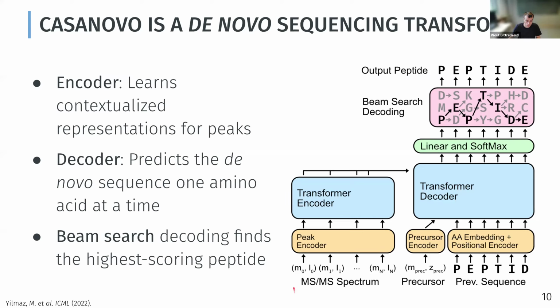Yeah. So the encoder receives just the peaks of the spectrum as input. And so each peak is represented by a tuple of two values, the mass and the intensity. And those are both encoded using a sinusoidal representation, rather than providing them as individual floating point values, which does still work, but is typically a little bit less expressive for the neural network.